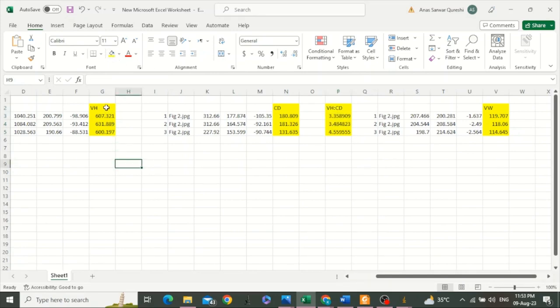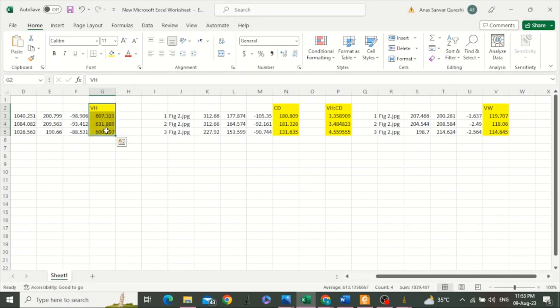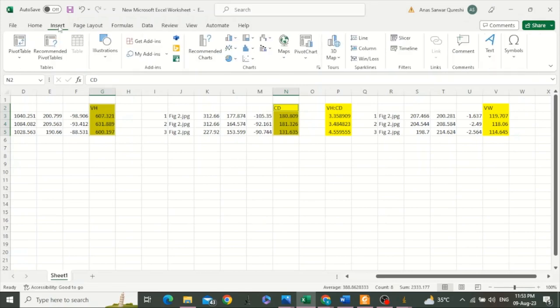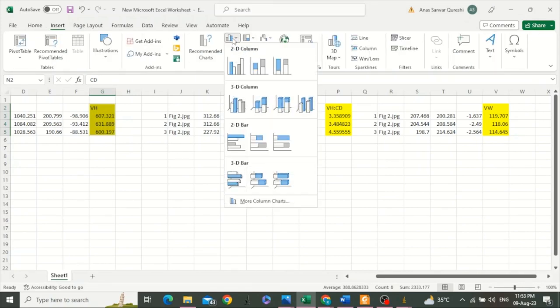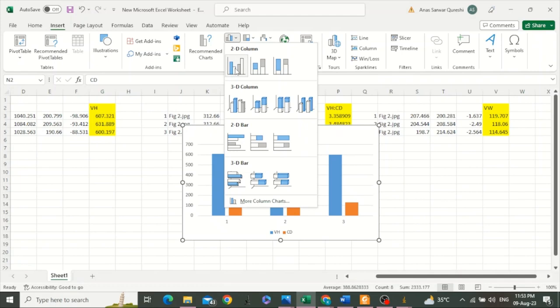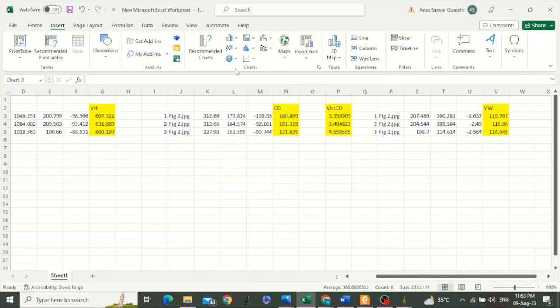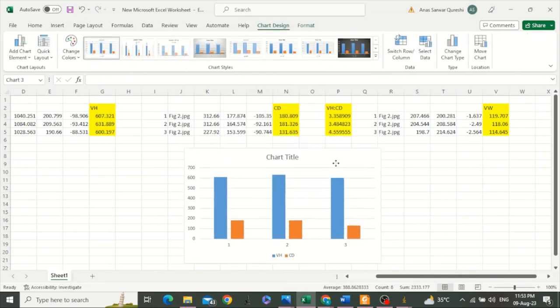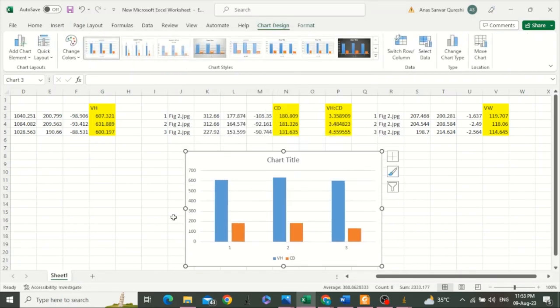Another thing that we can do: we can draw a graph between villus height and crypt depth. Select these two columns by holding the Control key, go to Insert, then Charts, and insert a column chart. You can rename it and use it in your publication.